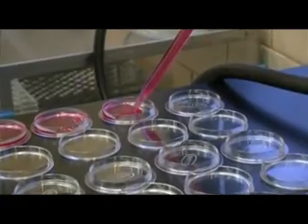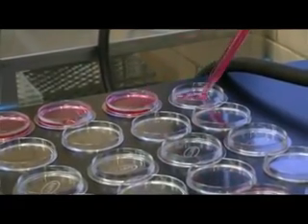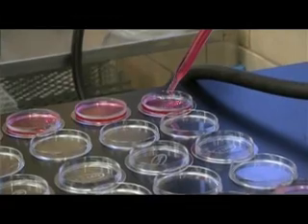With us here today in the lab is Al Diaz-Mazaredo. He's our microbiologist, and he is preparing the plates that we use to test for total coliform bacteria.